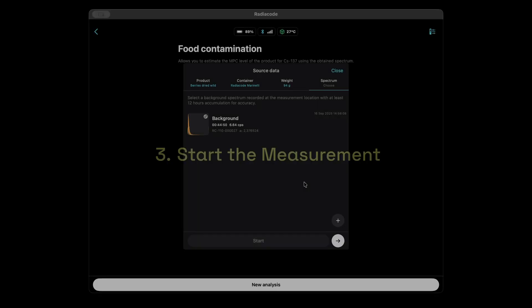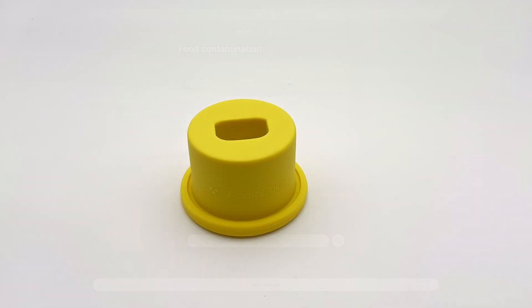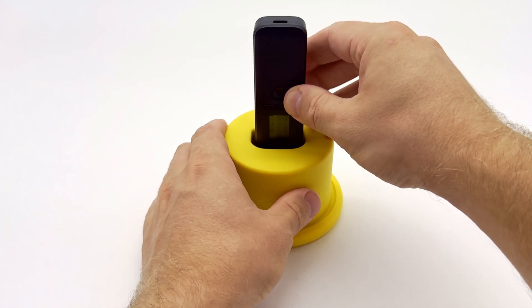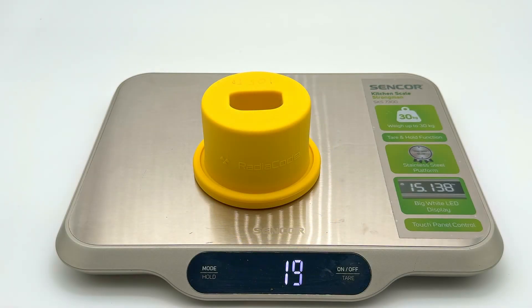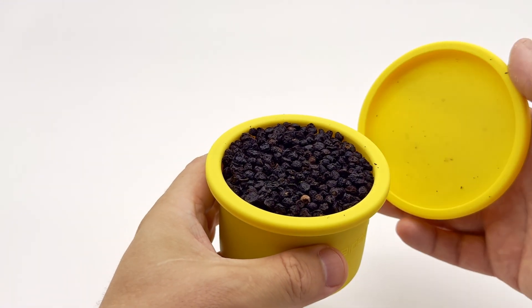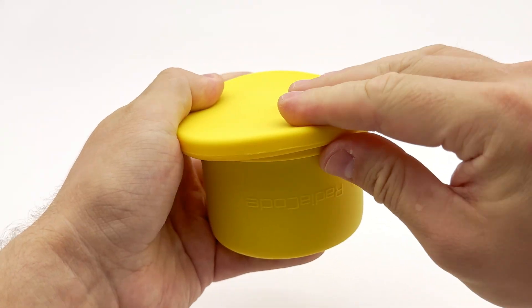Step 3: Start the data collection. Go back to activity mode, select your saved background, place the Radiocode in the filled Marinelli beaker, and press start. Important details: the sample weight must be accurate and the container must be filled to the top, otherwise results will not be reliable.